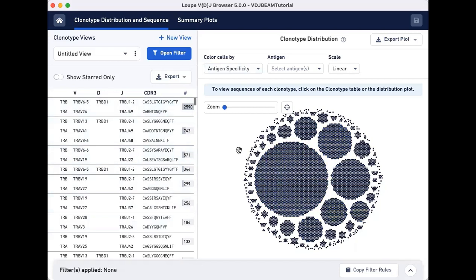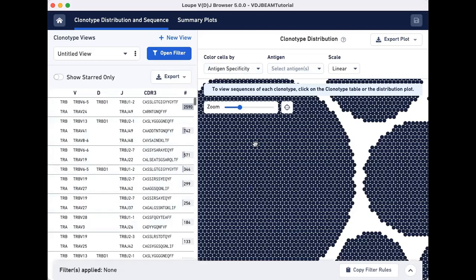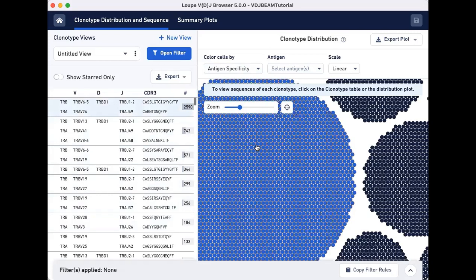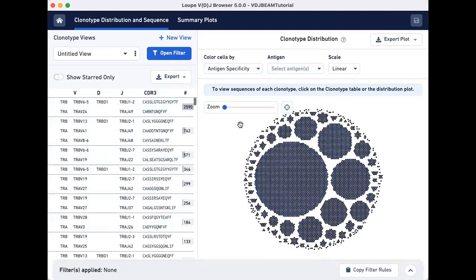On the right, the Clonotype distribution plot is a graphical representation of the clonotype list showing all cells grouped by clonotype ID. Each circle represents a single cell or a cell-associated 10X barcode. Larger clonotypes are in the center and smaller clonotypes are towards the periphery.